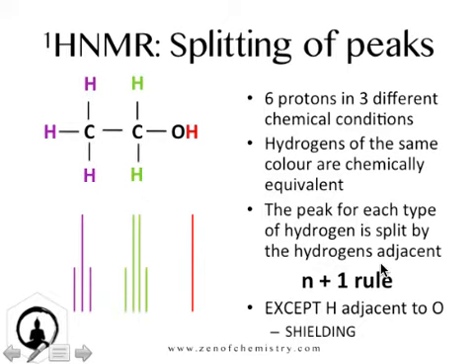And we use this thing called J3 coupling. It has to be able to go through 3 bonds. So from this hydrogen here, we can go 1, 2, 3 bonds. So that hydrogen there and that hydrogen there can talk to each other. That's kind of how it works. They affect each other. We can't have this hydrogen talk through 1, 2, 3, 4 bonds to this hydrogen here.